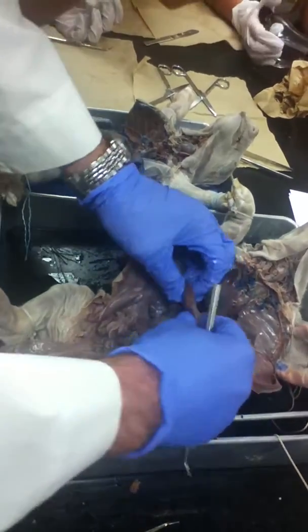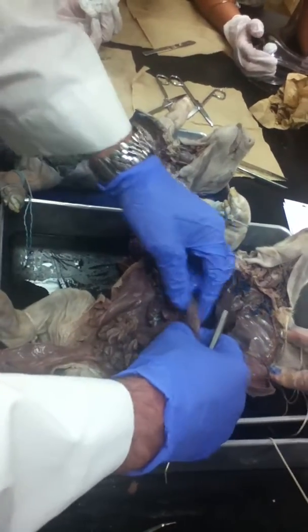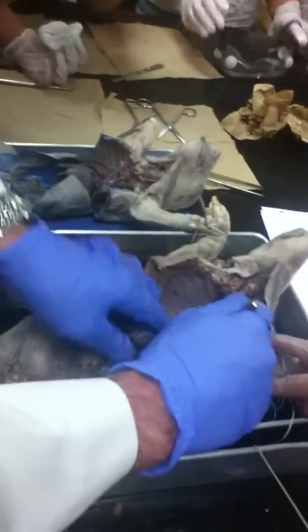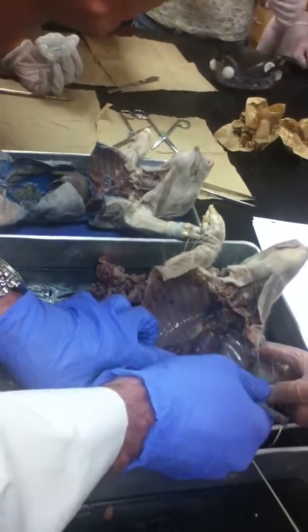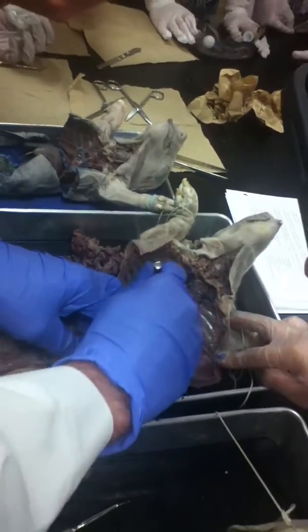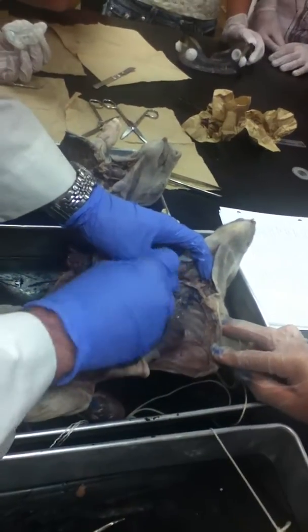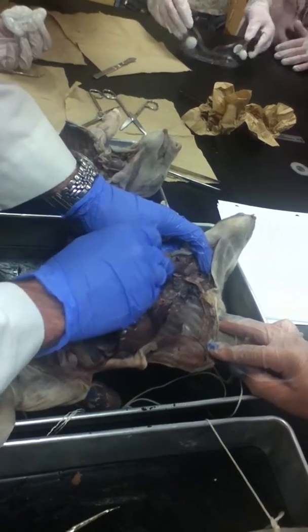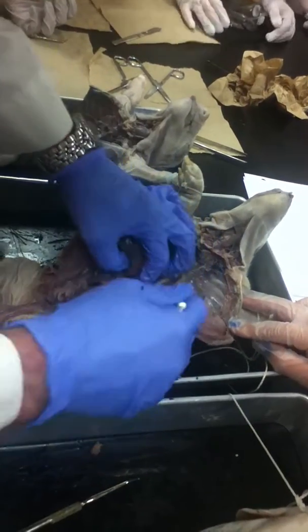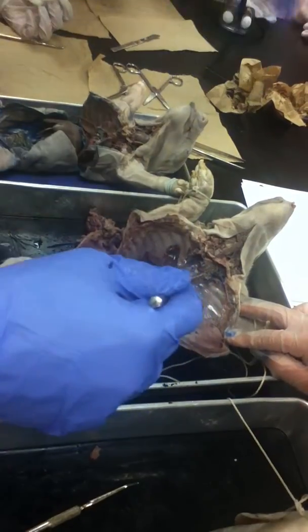Stomach is this right here, okay? That's the stomach, yeah. The esophagus, okay? We already showed the esophagus earlier, but the esophagus, you could see. Oh, wait. Kidney. No, kidneys are by its butt. I'll show you up here. That's the esophagus, right there, okay? Esophagus goes down and connects into the stomach, which if you tear away some of this tissue, you'll be able to see it, okay? But the esophagus connects into the stomach.